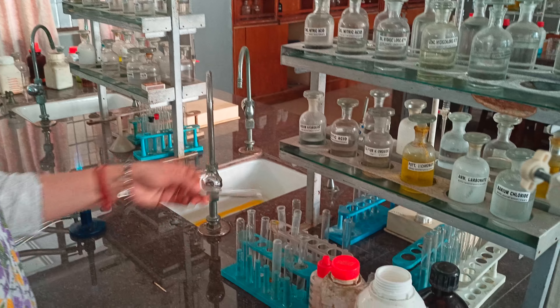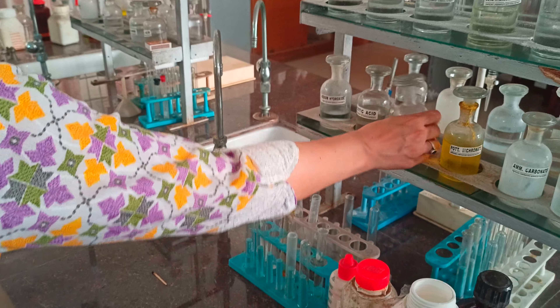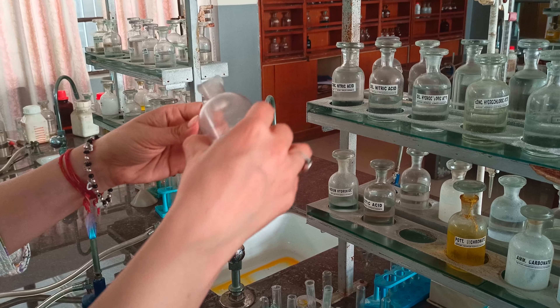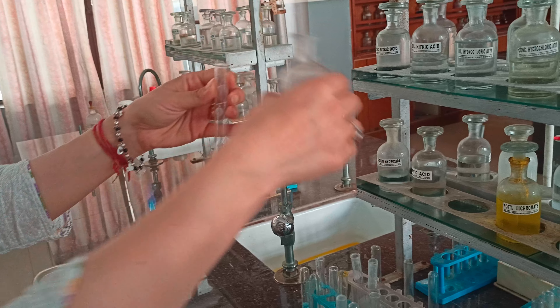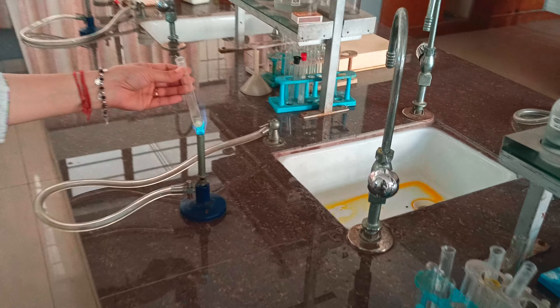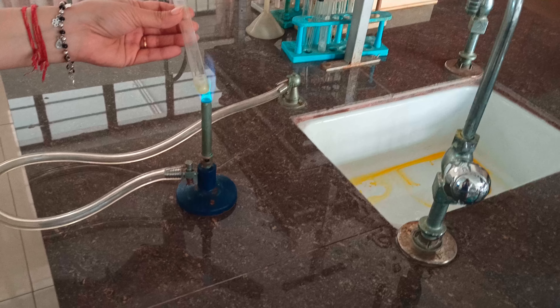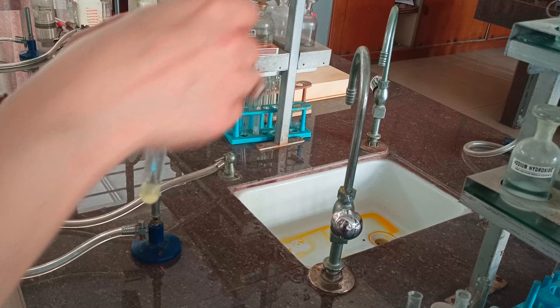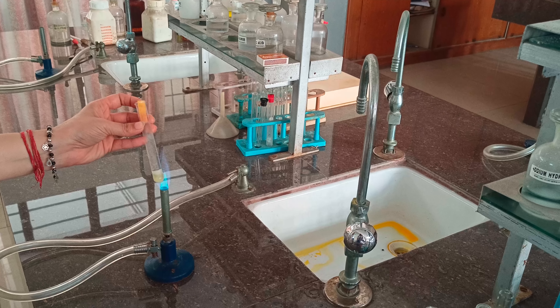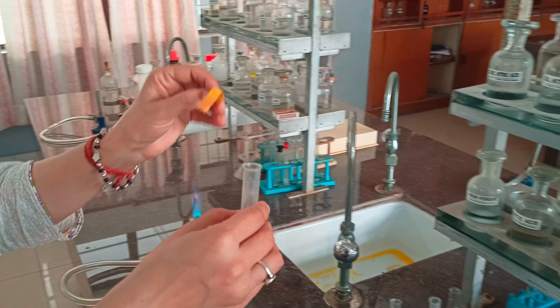After confirming the chloride ion, we have to confirm the ammonium ion. Ammonium can be detected in Group 0 and Group 6. We will take the salt and add concentrated sodium hydroxide. When any ammonium salt is heated with sodium hydroxide, it gives an ammoniacal smell. We can detect this ammonia using turmeric paper — on heating, the ammonia will turn the turmeric paper brown. You can see the brown color is formed, which is one test for ammonium ion.